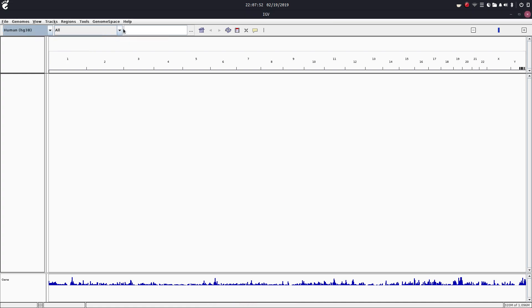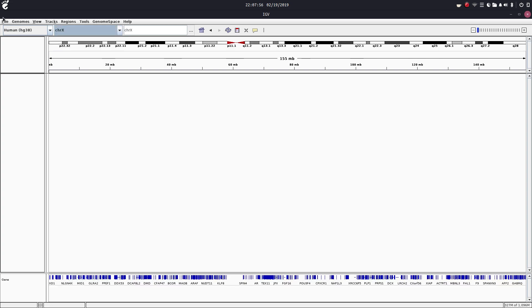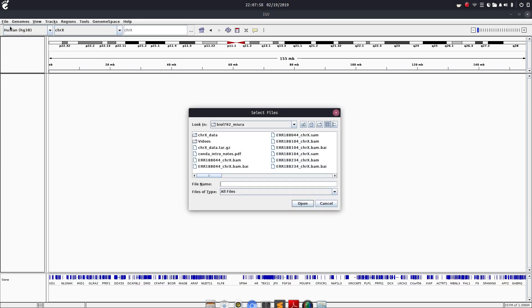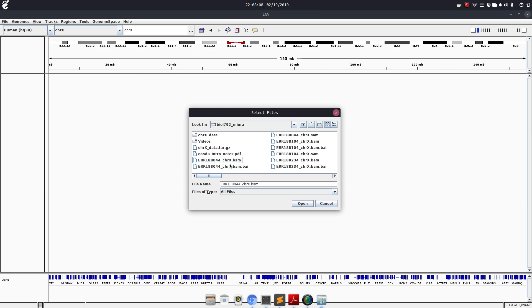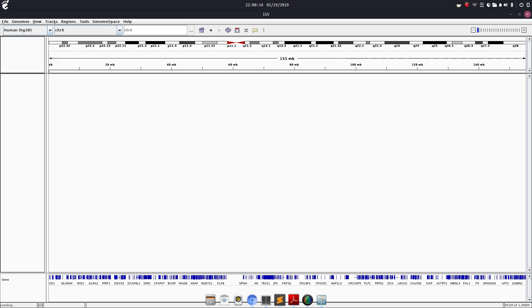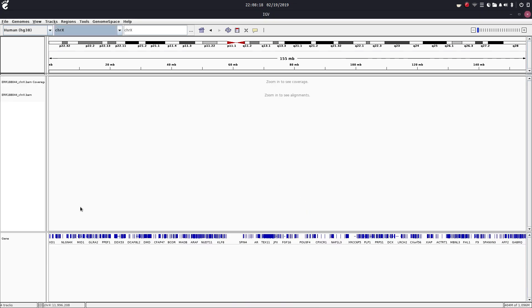We're on HG38. We're going to scroll down here to chromosome X. We'll go to File, Load From File - this is where I keep all my BAM files. I'm just going to load this BAM file. If you do not have the indexed BAM file, this BAM file will not load, so make sure that you've indexed your BAM files. Click on the BAM file and open it, and it'll load that up for you.